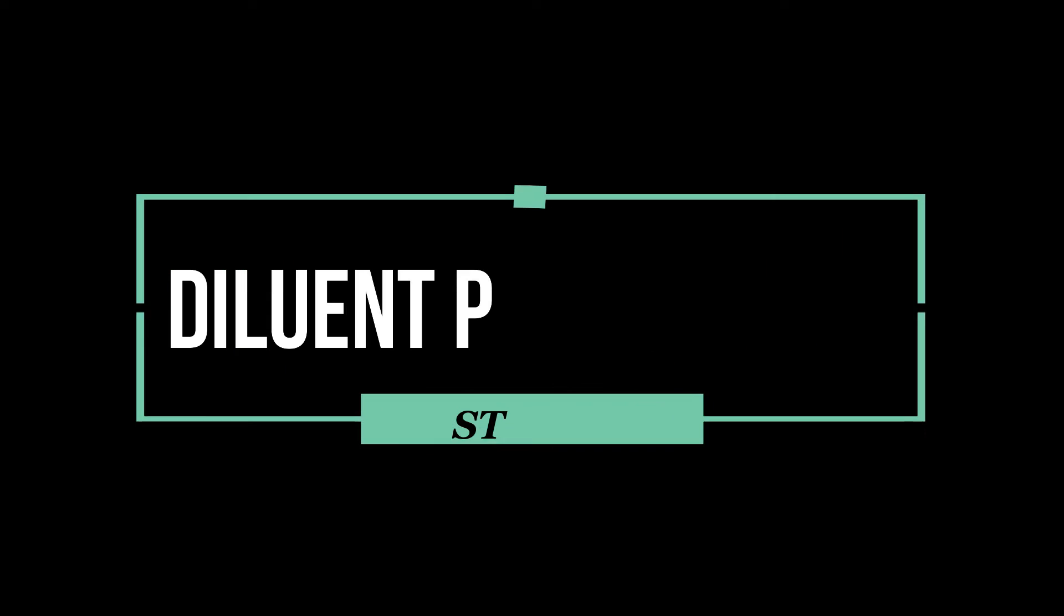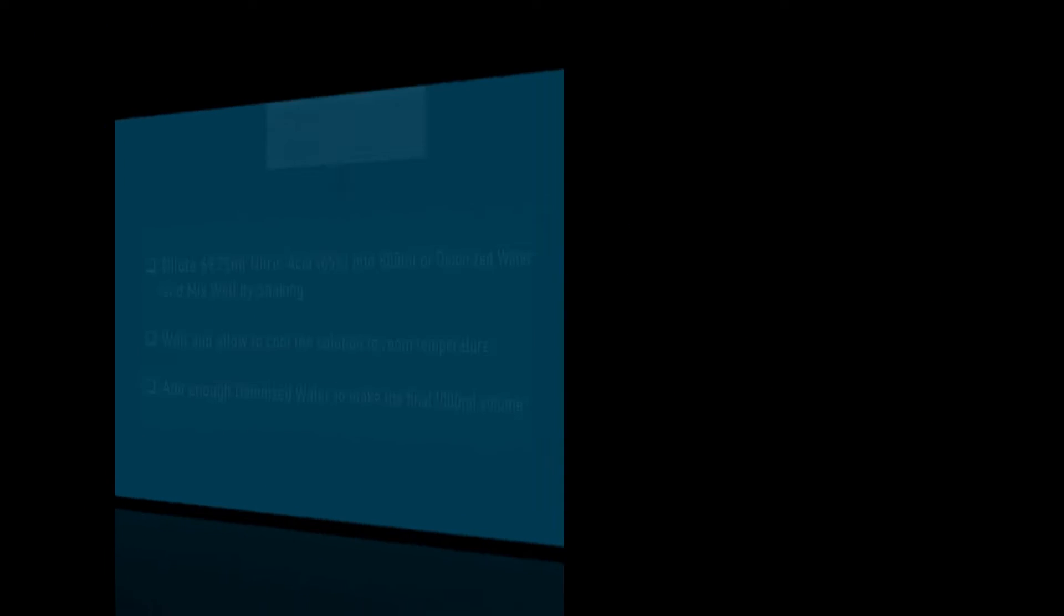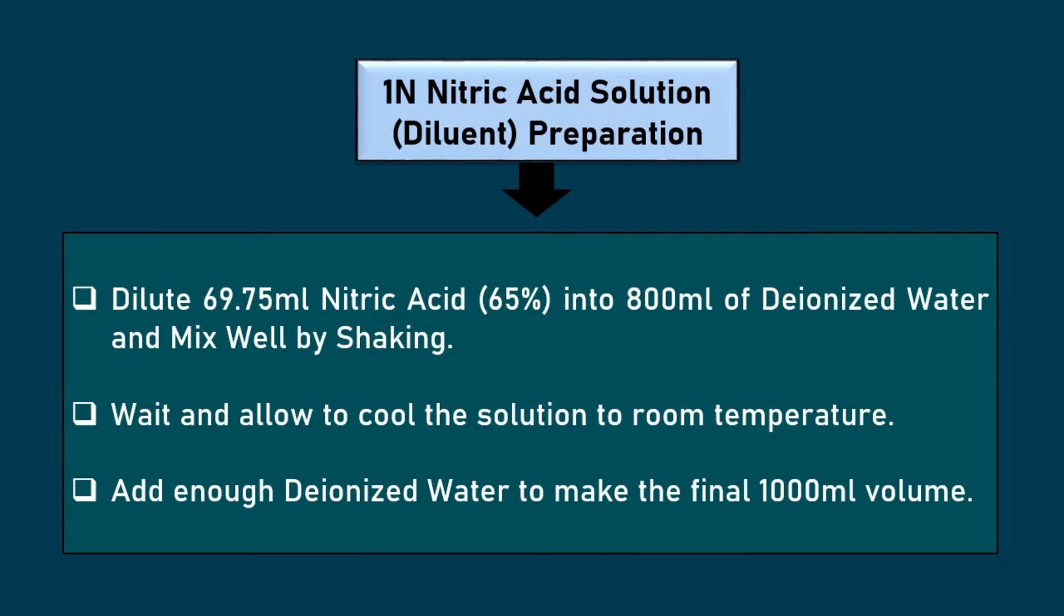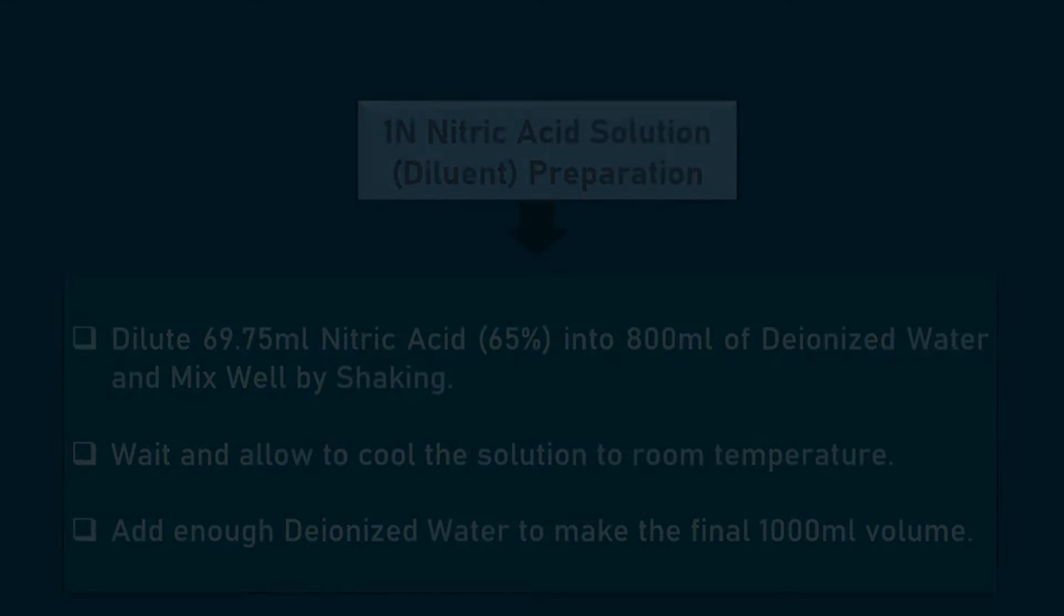We will use one normal nitric acid as diluent to prepare our sample. Dilute 69.75 ml of 65% nitric acid in about 800 ml deionized water. Mix the solution by shaking. Now, add deionized water to make the final volume of 1000 ml.